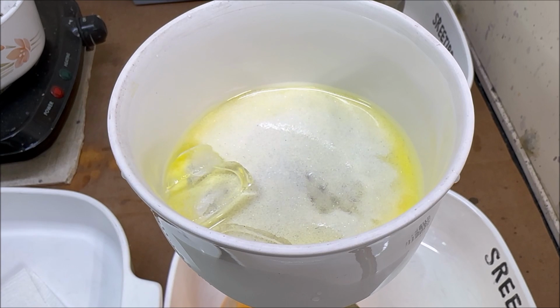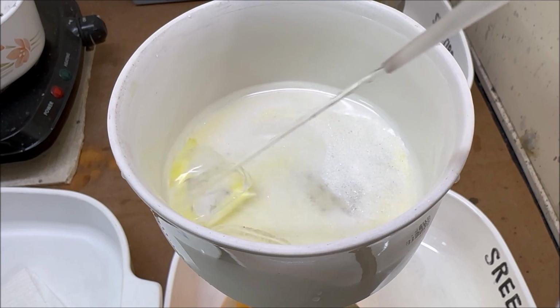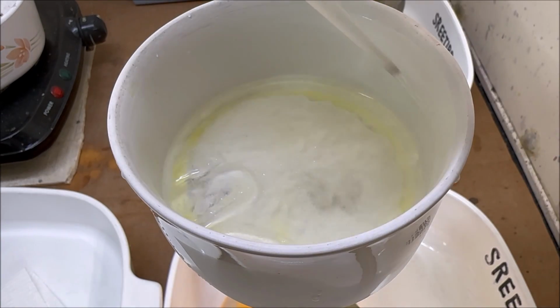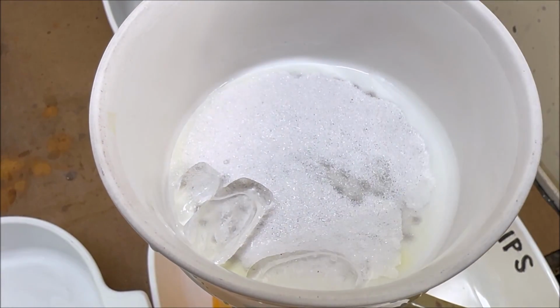Now our compound is looking a white color, grayish white, maybe beige, probably because we're rinsing the gold out of it with some distilled water. It's got a little bit different color now. Looked yellow before, but I think it's a white powder. Probably going to be lead chloride from the hydrochloric acid in the aqua regia. Here's a close-up look at the compound.